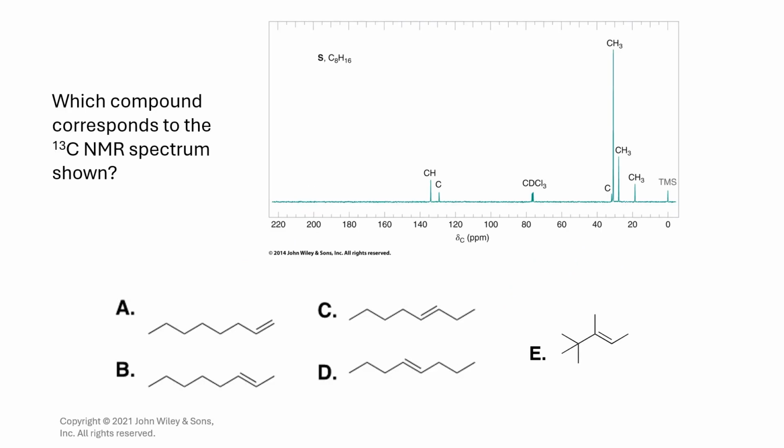And last one here. So what spectrum matches here? Notice this is carbon, but when you do DEPT, the coupling techniques, you can determine which of these signals are due to CH2, CH3, and CH. When it's C only, it means it's tetrasubstituted. We call that quaternary carbon.